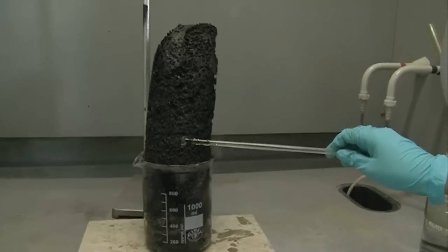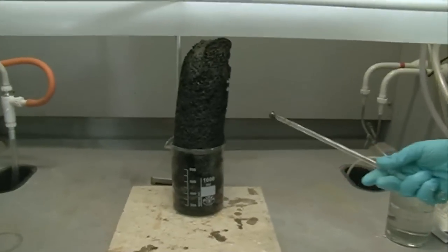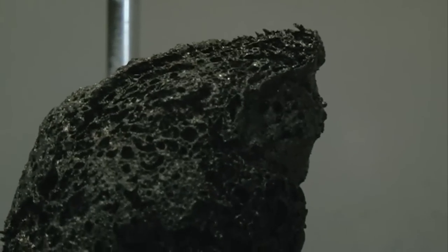Okay, so here, actually I can probably give it a bit of a poke. It's quite hard, actually. So what we've got, basically, is a column of carbon. A column of carbon, because what we've done is the sulfuric acid has dehydrated all of the sugar, so we've just got carbon left.